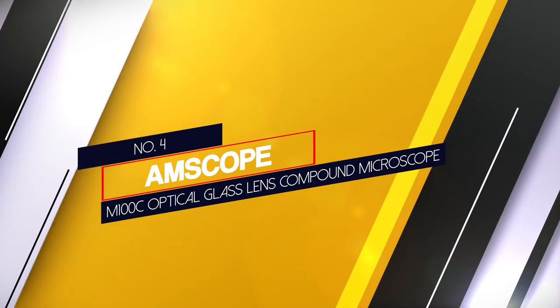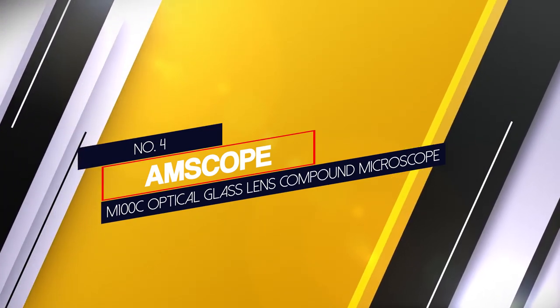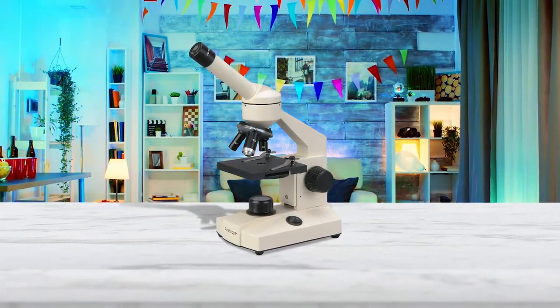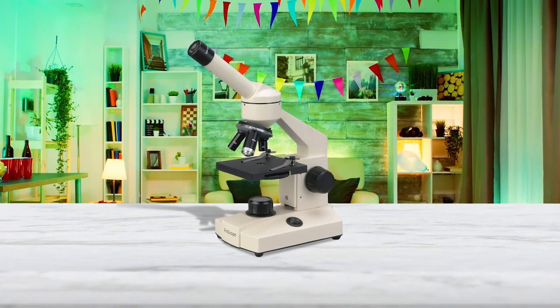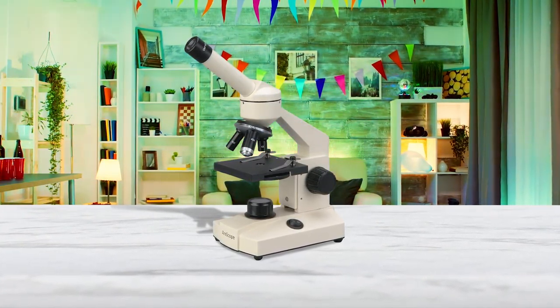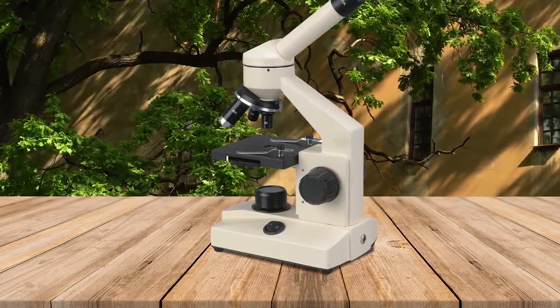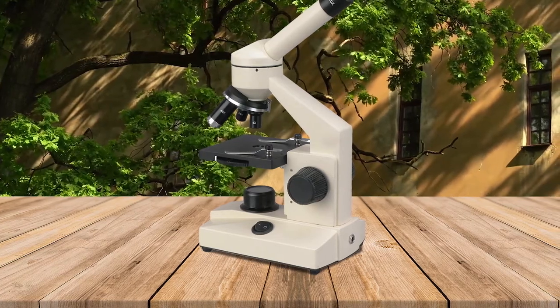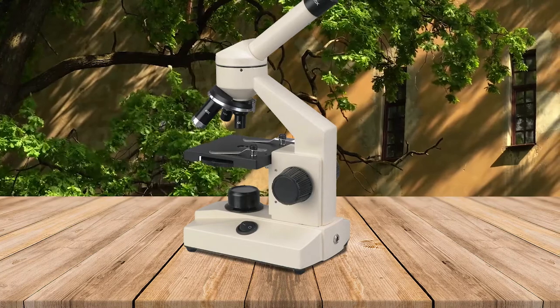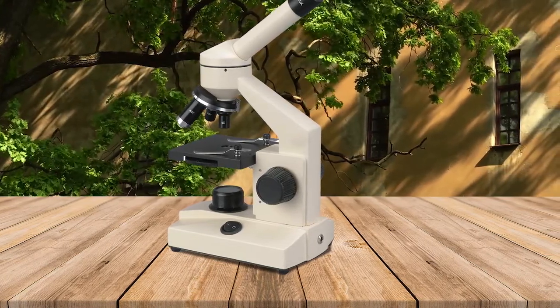Number 4: AMscope M100C Optical Glass Lens Compound Microscope. The AMscope M100C LED is the most affordable yet high quality biological microscope for young scientists 8 years of age or older. It is ideal for viewing cell tissue, bacteria, and fungi — both self-prepared slides and pre-made slides such as onion shells, leaf cells, cheese bacteria, etc. It makes the microscopic world within reach for everyone.